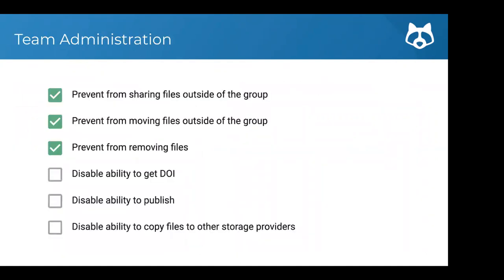Workspaces come with team administration settings. For example, if you're developing protocols you might not want to publish them yet, so you can disable the ability to publish. Also, you really want to make sure all team members' work stays within the team. If a team member leaves, all the files don't leave with them — they stay within the workspace. You can set it so only admins of that workspace are able to remove files.